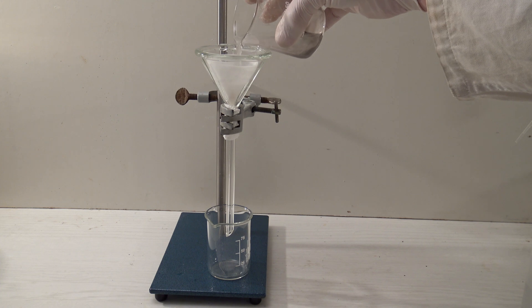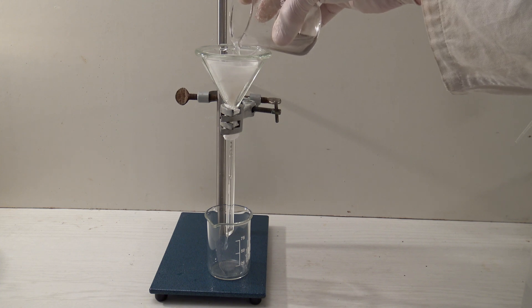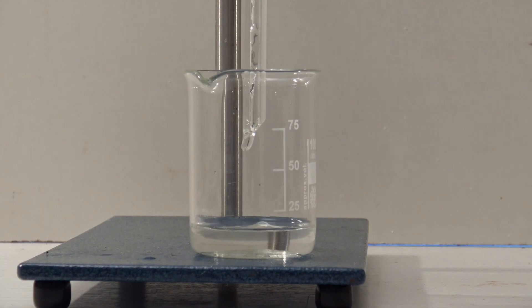After cooling down, the solution was filtered off. The filtrate is called soda extract and contains all the anions of the sample. For obvious reasons, this can't be used anymore to test for carbonates.